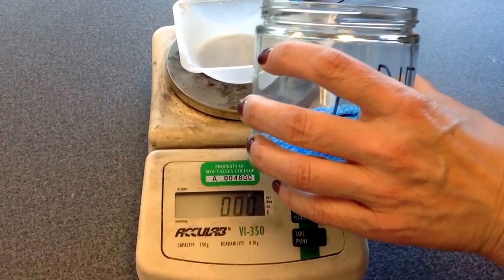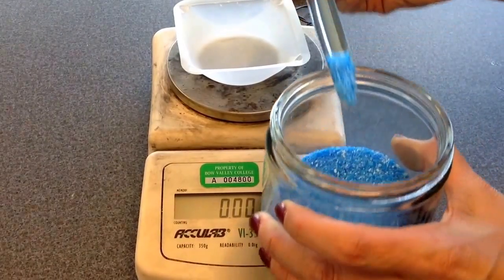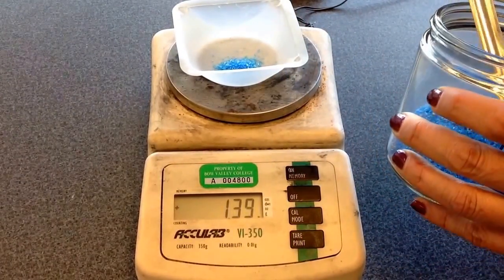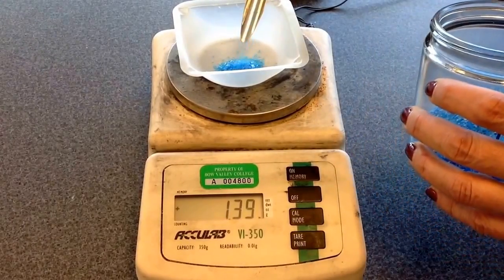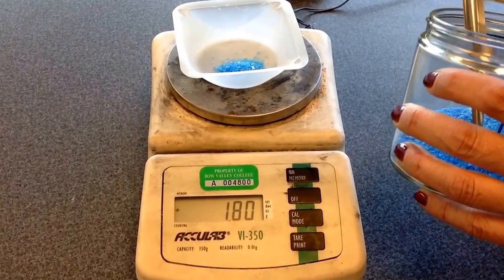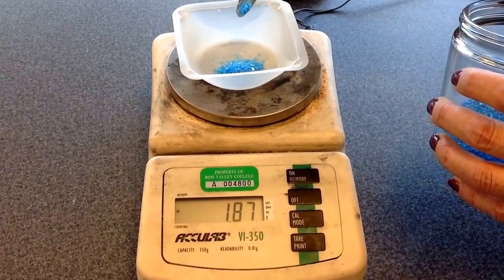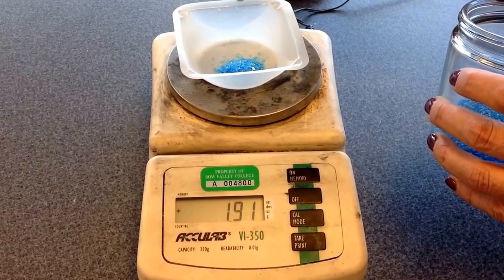Now I can proceed with my sample and my spatula, and I'm going to measure out my sample. Say I wanted to get two grams — I'm just going to slowly add, wait till I get close, and then go a little bit at a time and get as close to two grams as we possibly can.